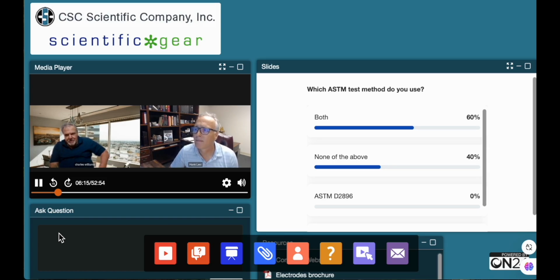Or if you're doing used oil testing, yeah, you would use both. We're going to get into that. There are some pros and cons to each of the methods, and I really don't know beyond why the specification might be one or the other than the fact that there's a pro to it and a con to it. But sometimes the specification just says do them both, right? Yeah. All right. So anyway, good to know, because we're going to build off of that.